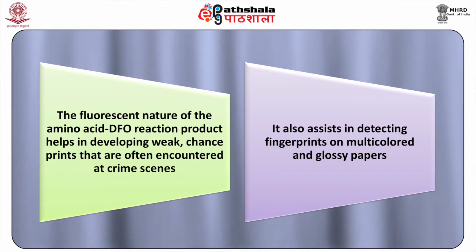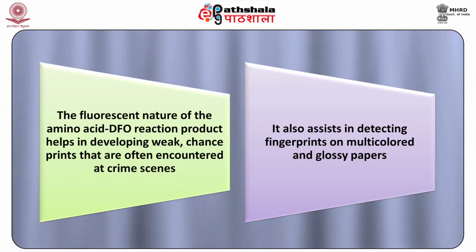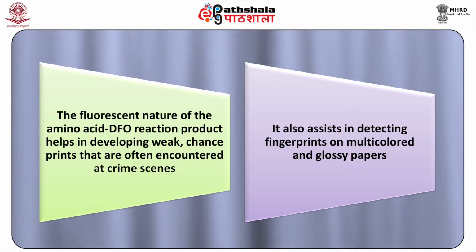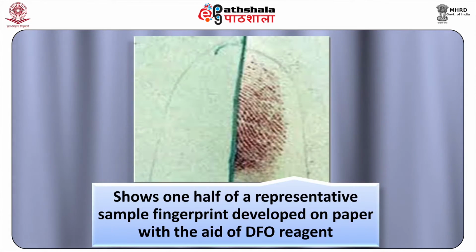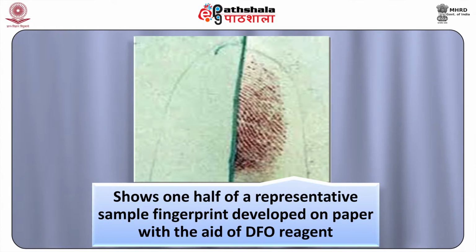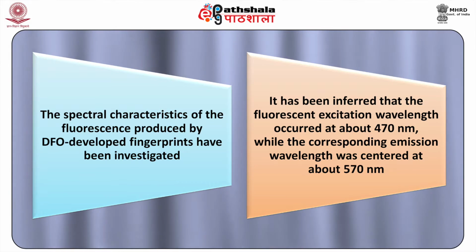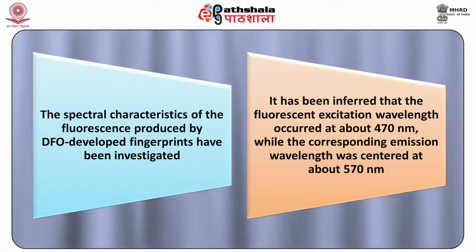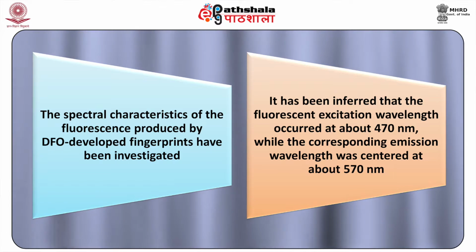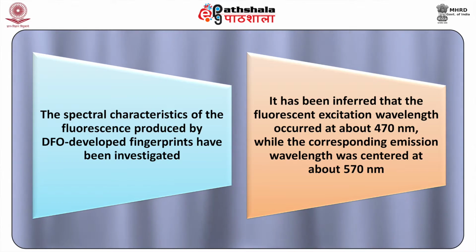The fluorescent nature of the amino acid DFO reaction product helps in developing weak chance prints that are often encountered at crime scenes. It also assists in detecting fingerprints on multicolored and glossy paper. The figure shows one half of a representative sample fingerprint developed on paper with the aid of DFO reagent. The spectral characteristics of the fluorescence produced by DFO developed fingerprints have been investigated. It has been inferred that the fluorescent excitation wavelength occurred at about 470 nanometer, while the corresponding emission wavelength was centered at about 570 nanometer.